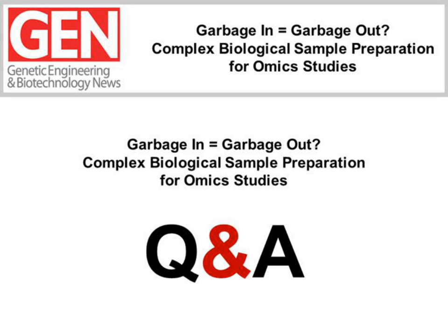And I guess since we are focusing on proteins and lipids in this particular webinar, I would cover the proteins. As I mentioned, phosphorylation has been worked on for a number of years, and there are commercial products and published academic work on enriching for phosphorylated proteins and phosphorylated peptides. In fact, most laboratories, as far as I understand, prefer enriching for phosphopeptides after digestion, although one has to deal with the initial sample complexity before the phosphopeptides are produced.